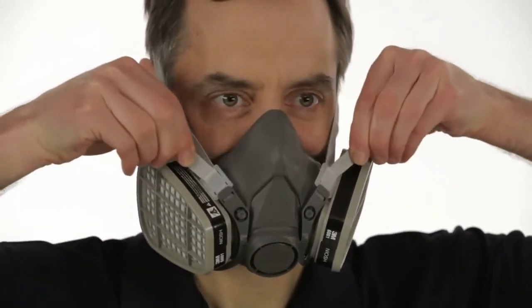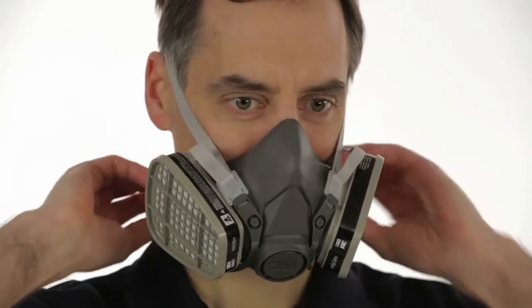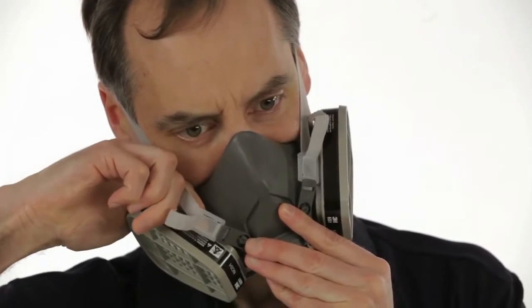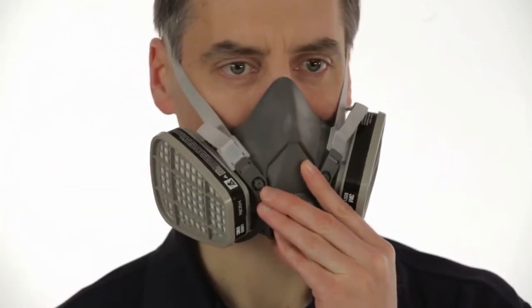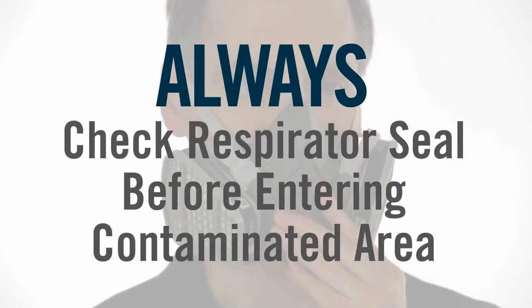Tighten the straps by pulling on the ends, top straps first, then the bottom, until the respirator fits securely but comfortably. Do not pull the straps too tight. If the straps are too tight, push out on the back of the buckles to loosen them. Always check the seal of the respirator to your face before entering a contaminated area.